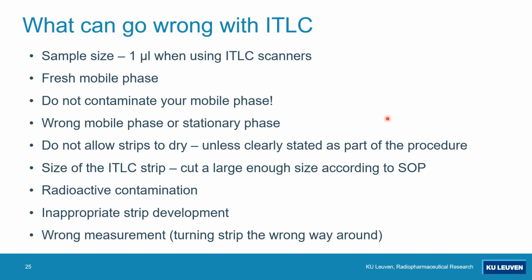Choose the right one for the radiopharmaceutical that you are using. You should not allow your strips to dry unless stated as part of the procedure. The size of the ITLC strip, you should not cut corners, cut it large enough for what you have to do. So don't make the strips too small, too thin. All of these things can save you time. And I know this is the number one complaint, but all of these procedures, they take time, but this is to cover you as well as make sure that your patient is safe in the end.